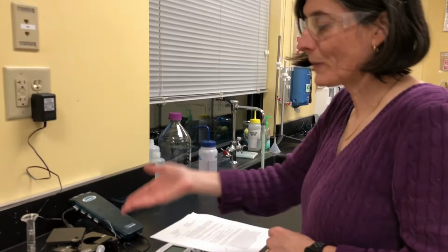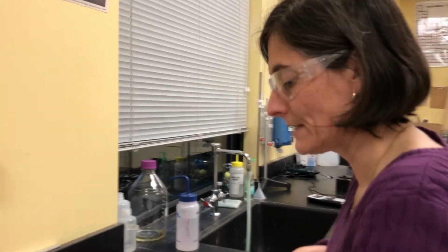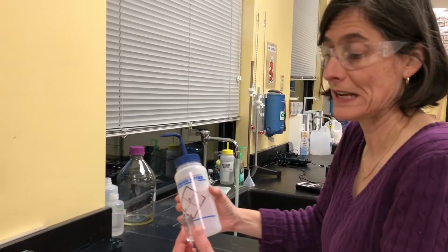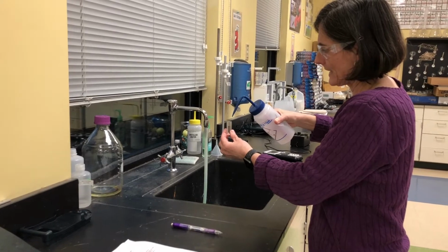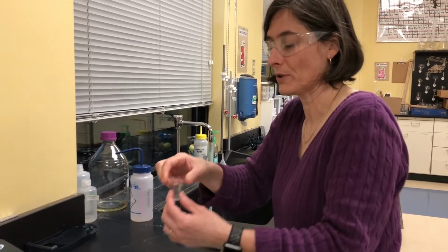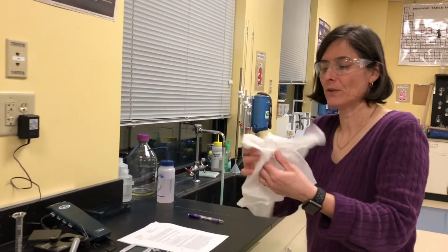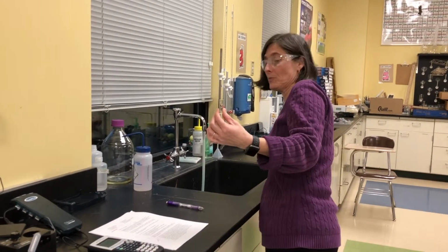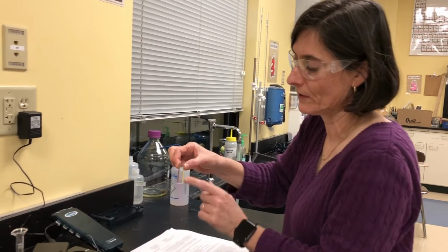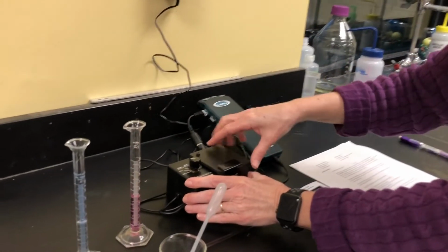The other thing we have to do is calibrate this colorimeter before we actually use it to do our experiment. So I'm going to go ahead and go through that process right now. To calibrate it, I'm going to use just deionized water. So I'm going to fill it about 3/4 of the way with deionized water, and I did condition this with deionized water too before I started. If you're worried about getting smudges on it, or if you're worried about it being wet, you can always take a chem wipe or a paper towel and wipe it down before you start, just to make sure there's no fingerprints on the clear sides. So I'm going to go ahead and insert that into my colorimeter.